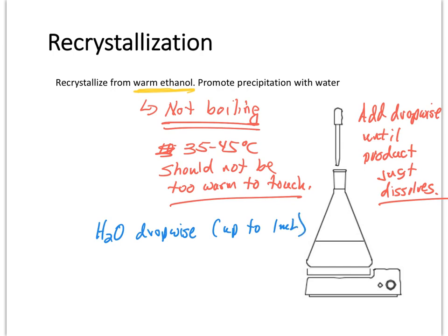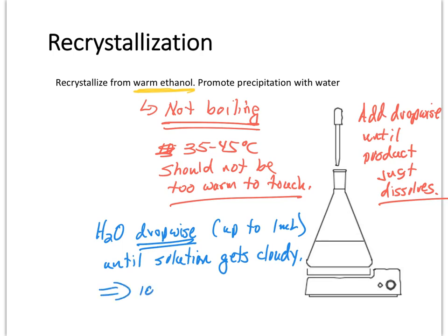Don't just dump 1 milliliter in there. Add it dropwise until the solution gets cloudy. Then we're going to put it on the ice and collect the crystals.